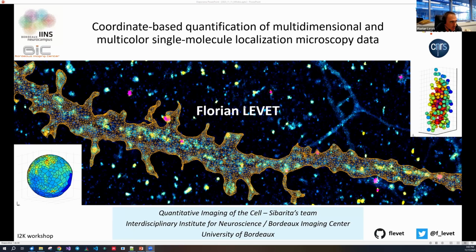So I'm Florian LEVET. I'm a researcher in the quantitative imaging of the cell team in Bordeaux, at the Interdisciplinary Institute for Neuroscience. And today I will present some work that we have done in order to do quantification of coordinate-based multidimensional and multicolor single molecule localization microscopy data.